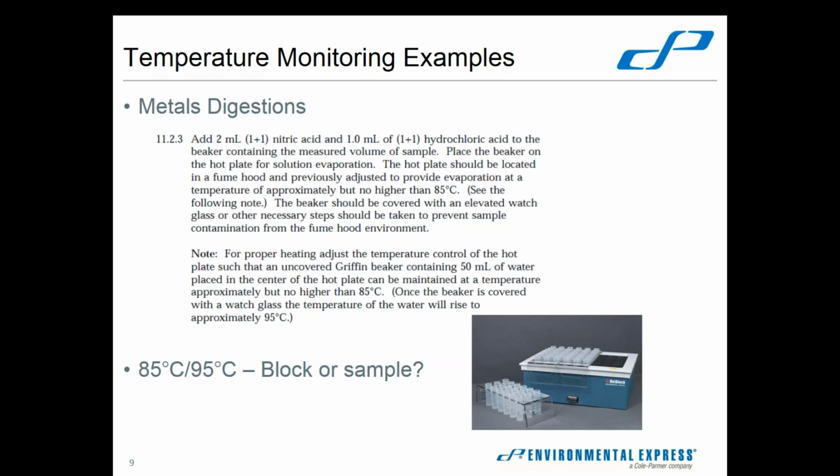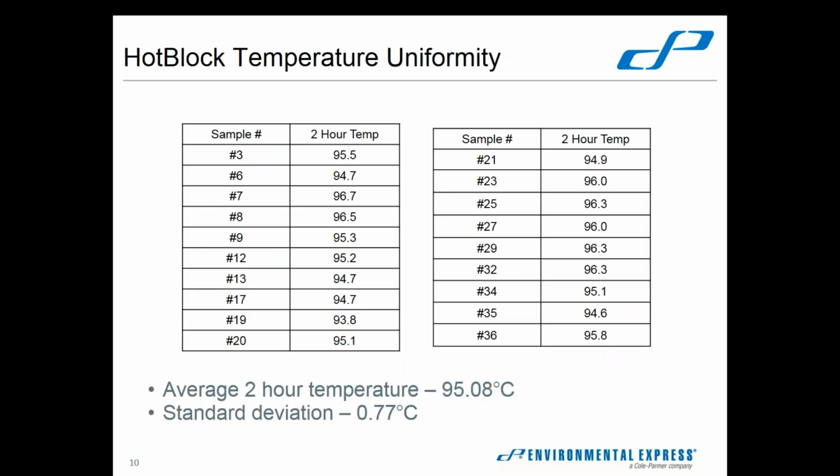So then what do you do? How do you check this? Well, you need to monitor the actual sample temperature. Some of you may have been asked to monitor the temperature of each individual spot on your hot block, and you may have constructed some charts.